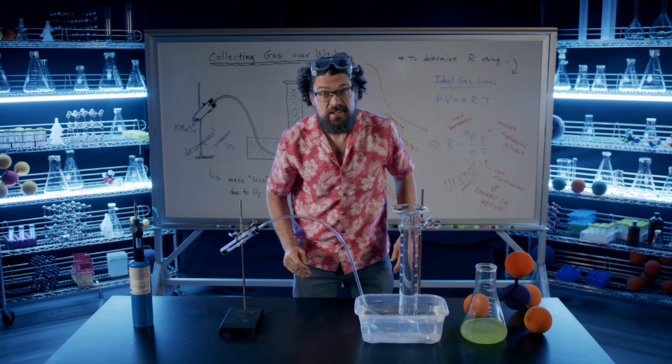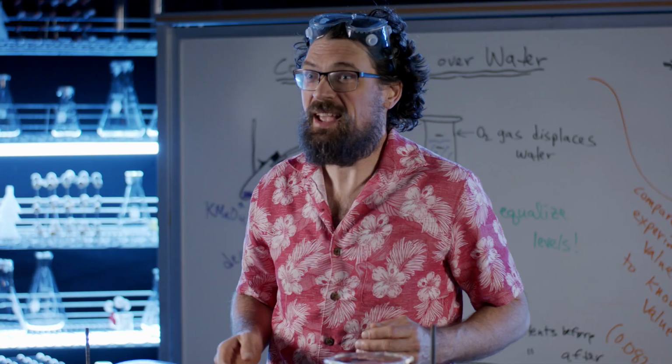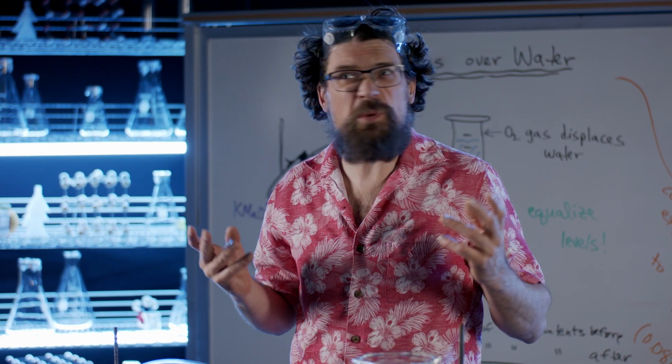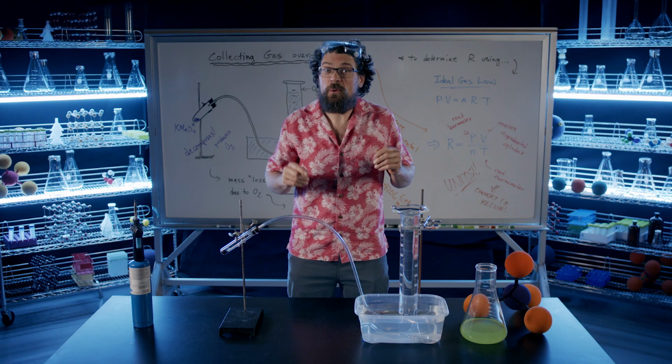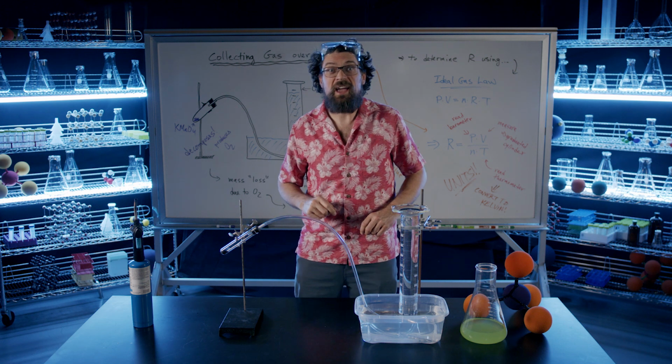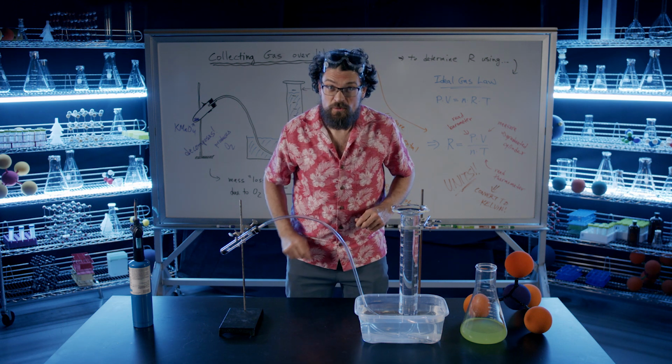Solids and liquids are easy to handle, right? It's a simple job to measure them in the lab. But what do we do with gases? For this, we're going to need a clever trap. I'm Matt Queen, and this is Collecting Gas Over Water.